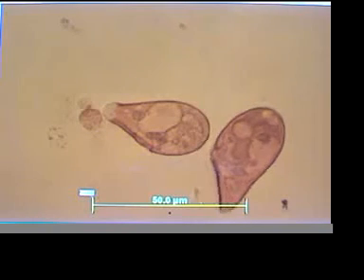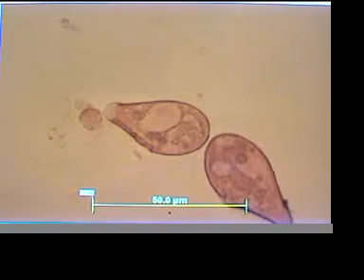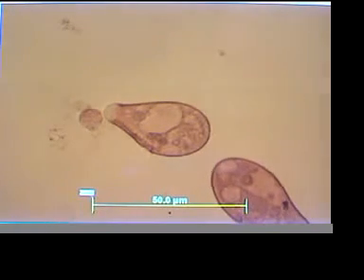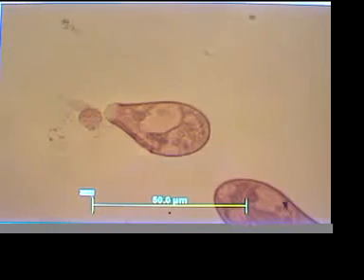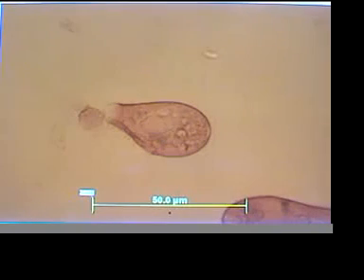You can see that the end is already beginning to disintegrate, but I don't know if it's going to continue, or I think we'll watch it for a minute. This is 925 hertz, and it's only been on for 90 seconds or so. Let's keep an eye on this. Good picture. There you have a good view of the outline of the organism. I'm going to watch this other guy down here.